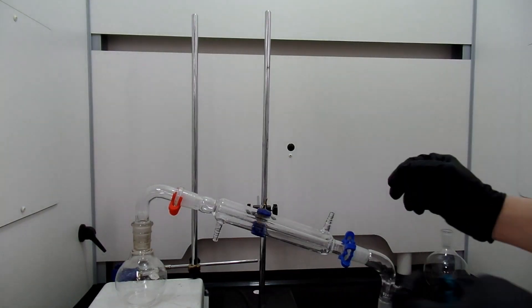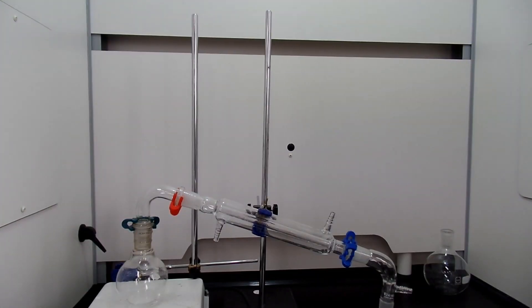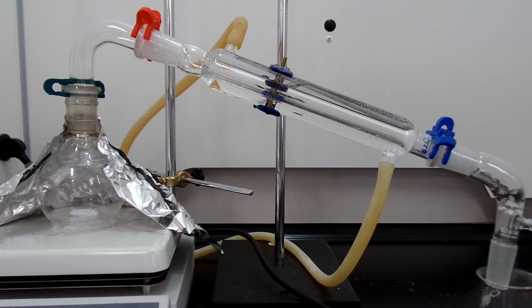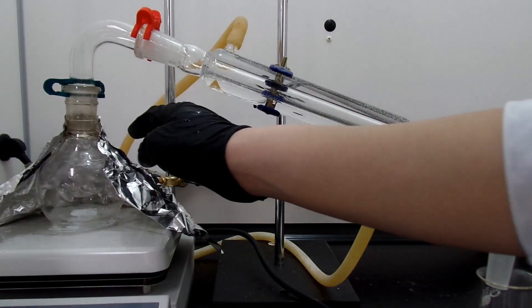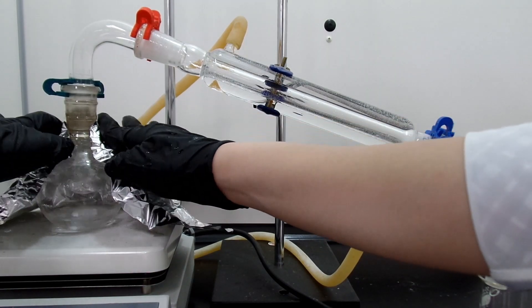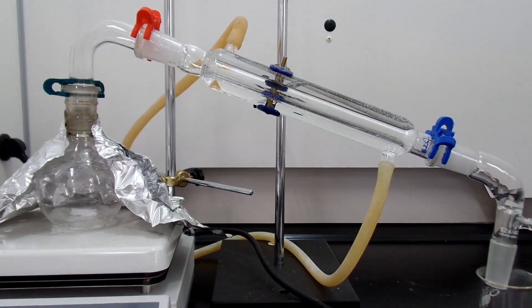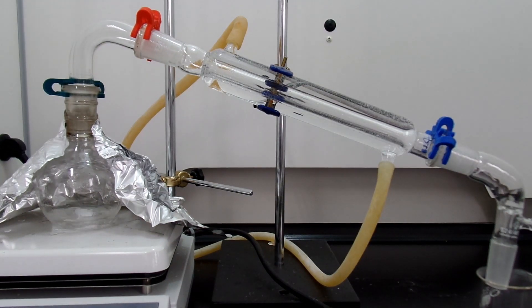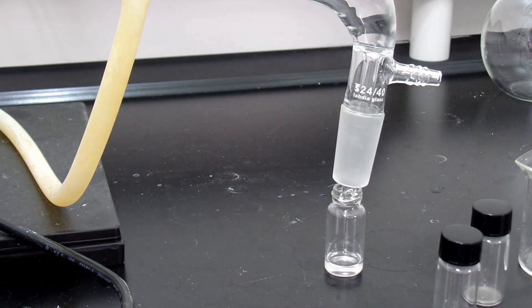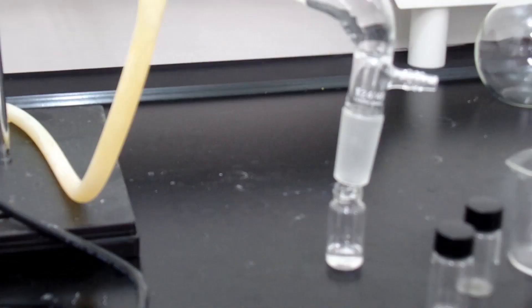Lastly, set up a simple distillation. Crank up the heat to about 150 degrees Celsius. Since the boiling point of N-propyl acetate is 103 degrees Celsius, it's very close to the boiling point of water, so some water will come over. Discard the first few drops, and after that, start to collect the N-propyl acetate.